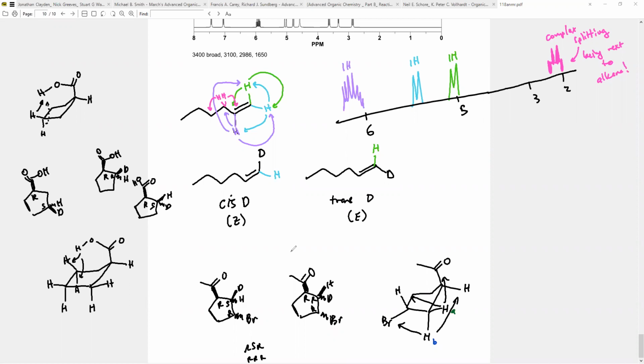Okay. Cool. So hopefully that helps you understand diastereotopism and how to test for it. It helps you out with the shifts in terms of NMR and chemical equivalence. What it means is that a CH2 has the potential of having two different hydrogens. Most CH2s have a hydrogen A and a hydrogen A, they're the same. But diastereotopism tells us that we can have two different hydrogens. So how can that be represented in the NMR?